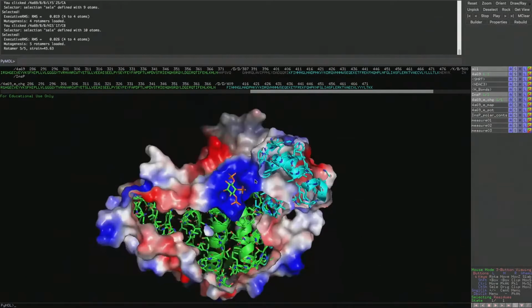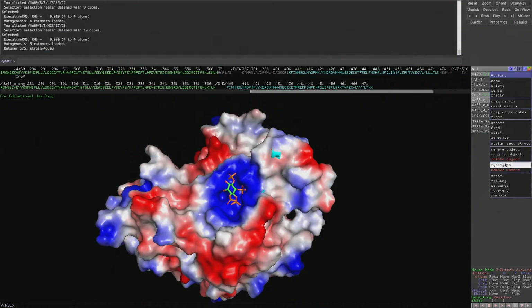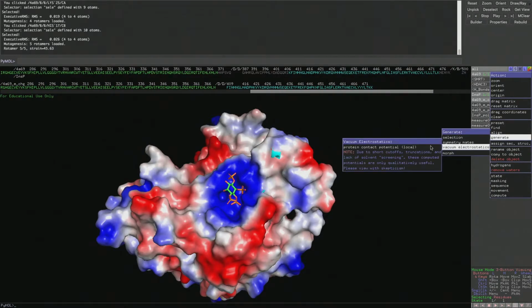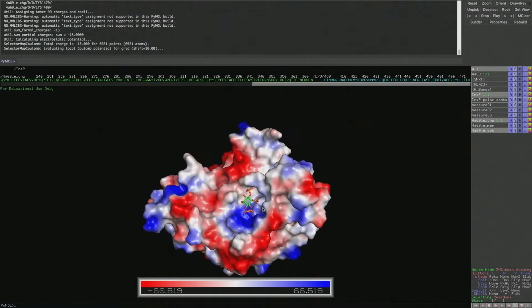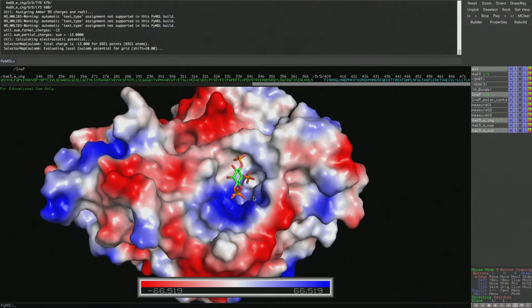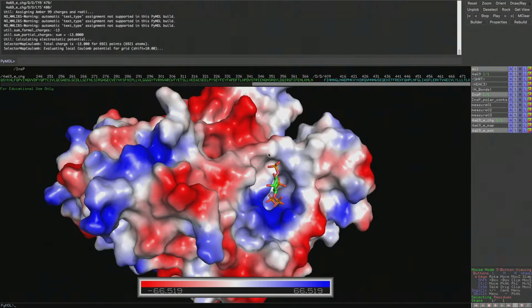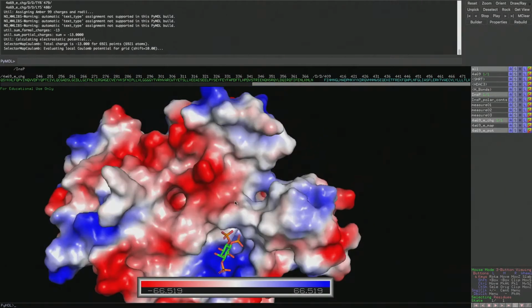So obviously, as you can see here, we need to generate a new charge map. So we're going to go to Action, Generate. And you can see the majority of the blue's gone. I've missed a few down here, but as it's telling you that it was these residues causing the charge interaction, now the likelihood is this may not work.